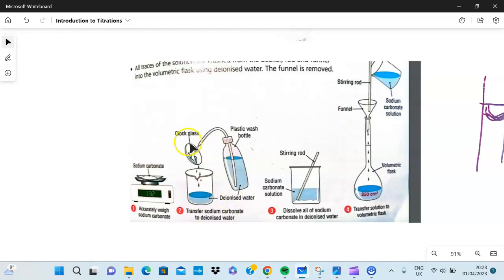After putting the reagent sodium carbonate into the beaker, you're going to wash it with this wash bottle. You can see this tube-like structure that's going to clean every single last speck of that reagent from that clock glass. It could be that little tiny amount that you can't even see on that clock glass that's going to make the difference for the entire experiment. After that, add about 100 cubic centimeters of deionized water, mix it all well together with a stirring rod, also known as a glass rod.